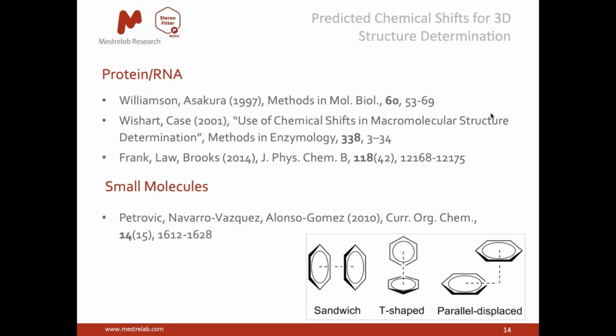And finally, we come to the use of predicted chemical shifts as a constraint for 3D structure conformation. This is the new guy on the block, chronologically speaking. Not that the theory hasn't been around for a long time, it has. It's just that it's taken a longer time for computers to evolve to be able to carry out the intensive number crunching required to make the density functional theory calculations possible in a non-prohibitive amount of time.